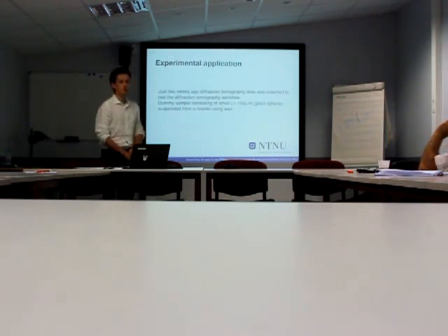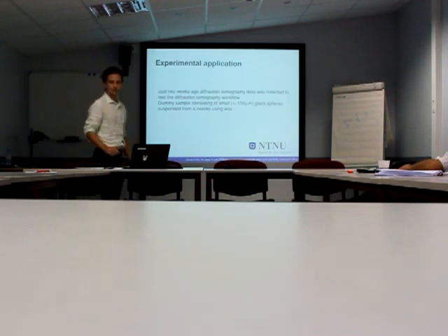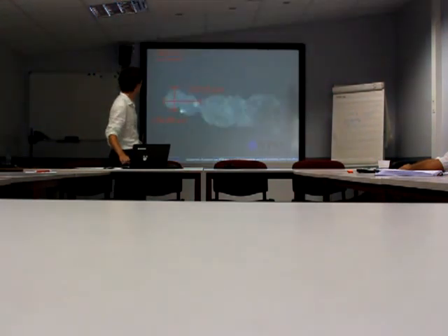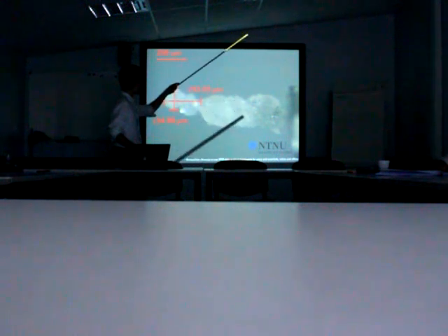So just 2 weeks ago, I had some beam time and I took some data. I prepared a small piece of glass spheres and some wax and made it stick to a tip of needle to test my tools. This is what it looks like. I think my scan, it should be in this area, and I just have one slice, unfortunately.